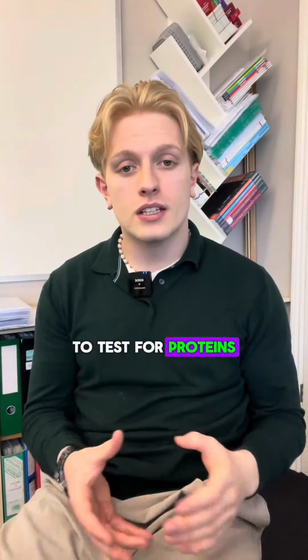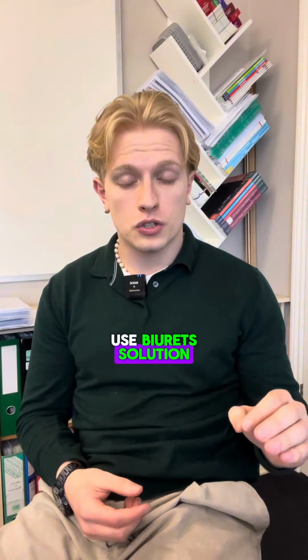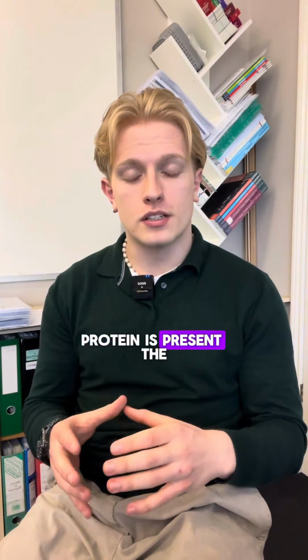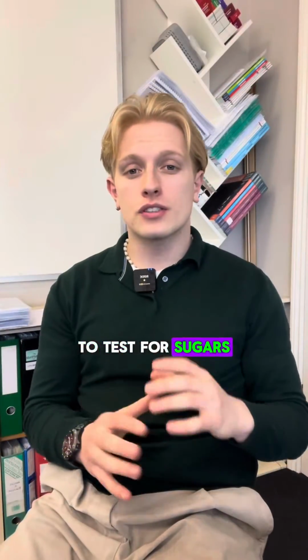To test for proteins is very similar. All we need to do is take your food substance, put it into a spotting tile again, and use Biuret solution. Biuret, starting with a B, is a light coloured blue. If protein is present, the substance goes from a blue to a lilac colour. Lilac is always on the mark scheme. That's a pinky purple.